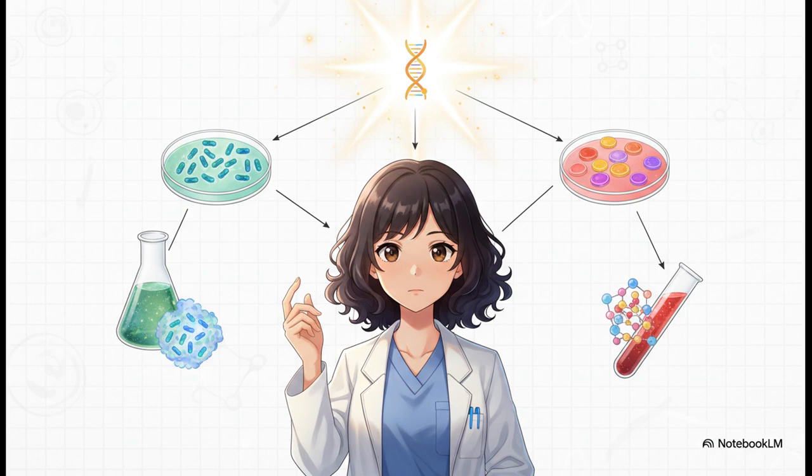And this is so much more than just memorizing facts for an exam. Choosing the right media is absolutely fundamental. It's the first decision you make, and it dictates what you can grow, what you can see, and ultimately what you can discover. Getting this first step right is everything.